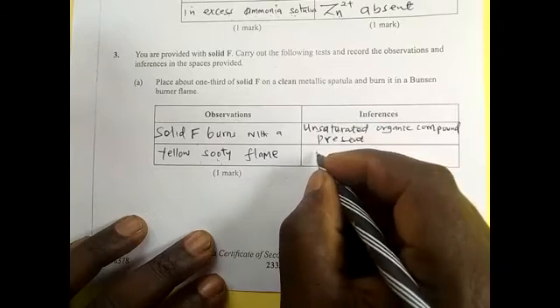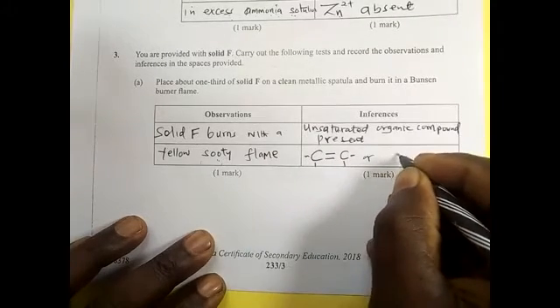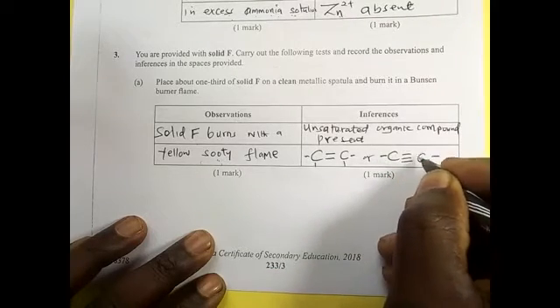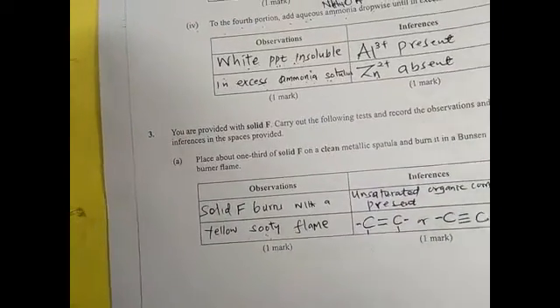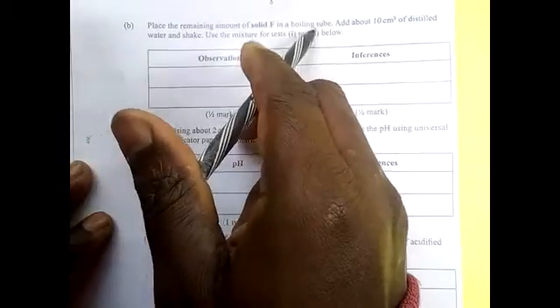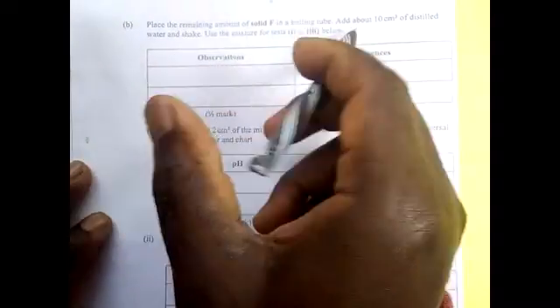If you forget this, write the double bond and make sure each carbon is surrounded with 4 covalent bonds, or the triple bond, making sure each carbon is surrounded with 4 covalent bonds, and then you say present. Place the remaining amount of solid F in a test tube. Add about 10 centimeters cube of distilled water and shake. Use the mixture for tests 1 to 3.